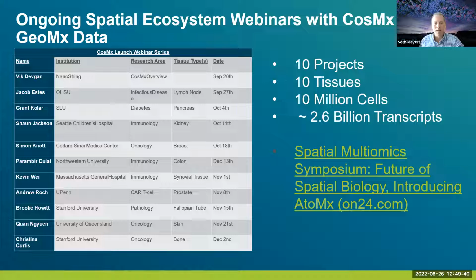We feel like there is a nice opportunity with CosMx to do consortium-type builds as well, because the consideration is always whether our folks in-house want to fully commercialize and market a panel and sell it on our website.